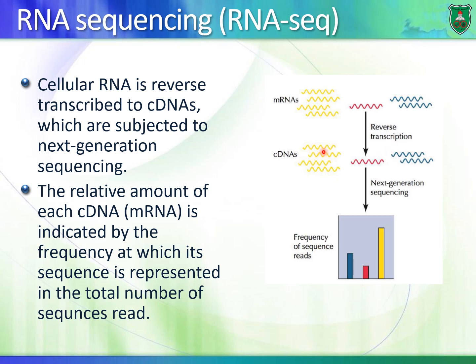Not only can we tell what the sequences of all the cDNA molecules are, we can also know how many times these cDNA molecules are sequenced, and that gives us an indication for the quantity of the messenger RNA.